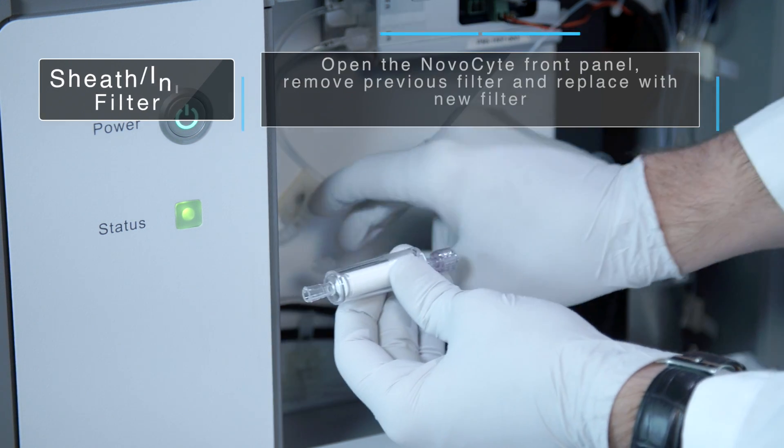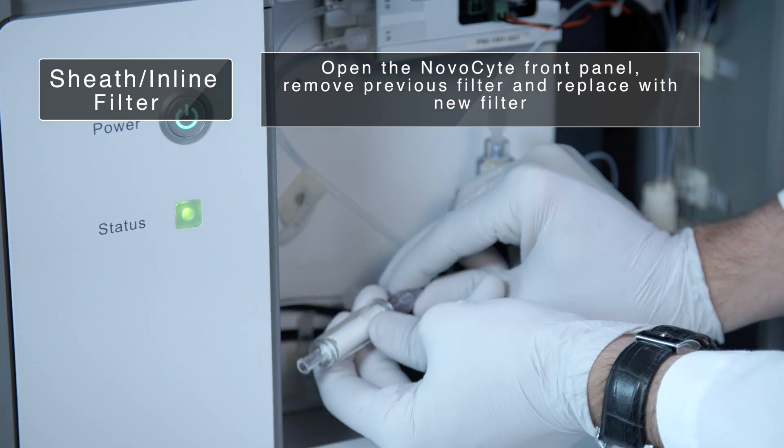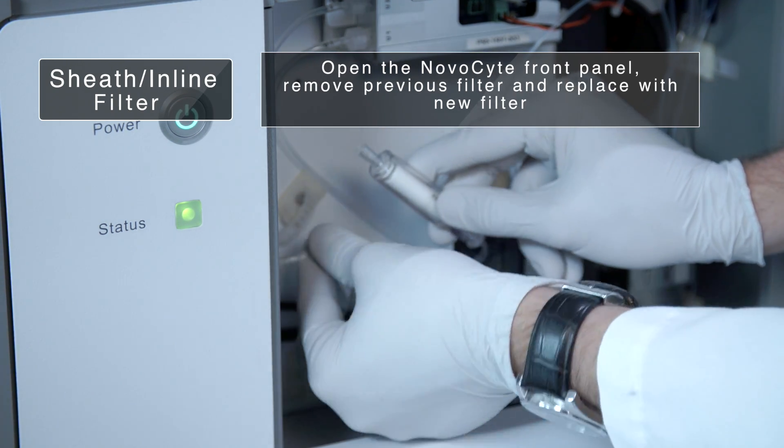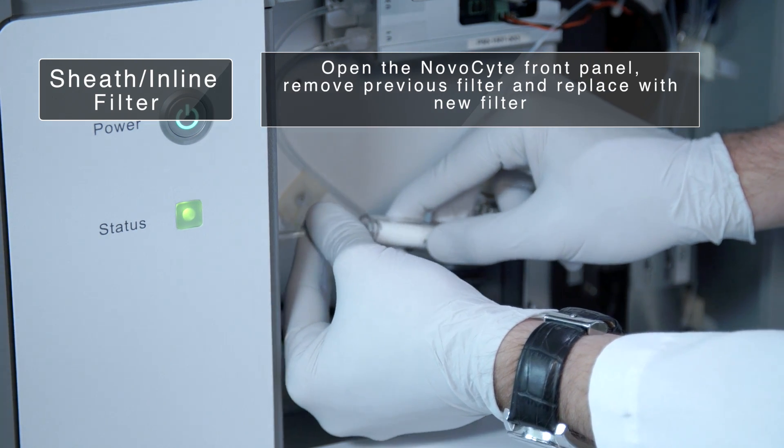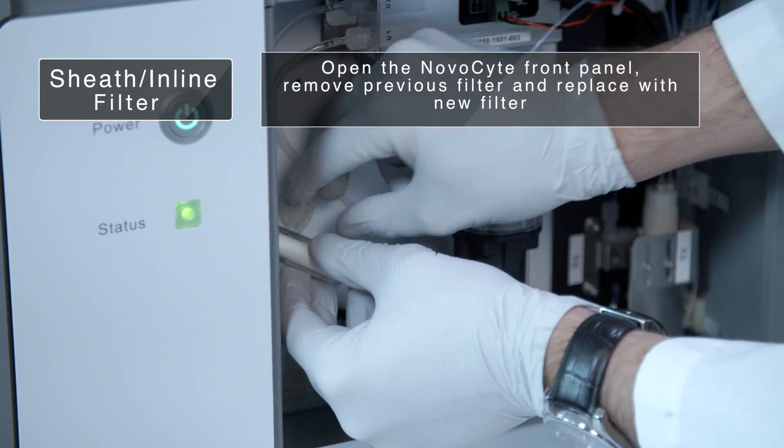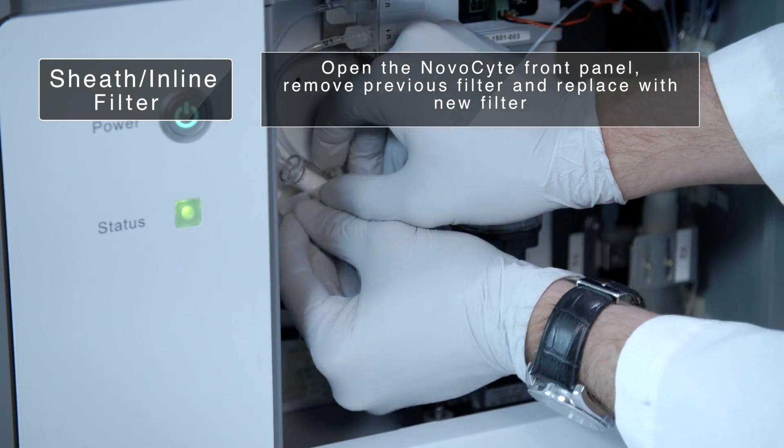The sheath inline filter is changed by following the directions on the screen, essentially unscrewing the two connectors, replacing the filter with a new one, and attaching the tubes to both ends as it was originally.